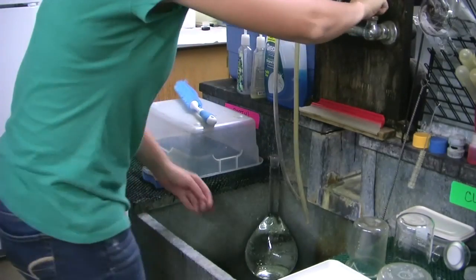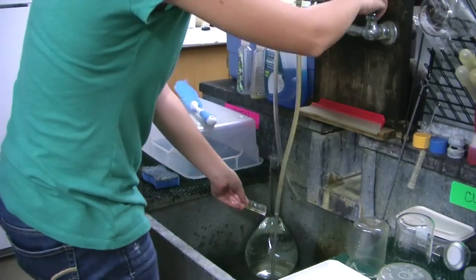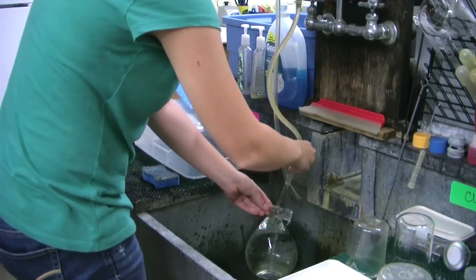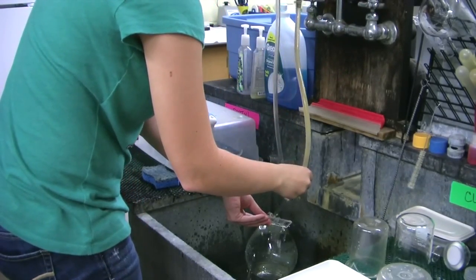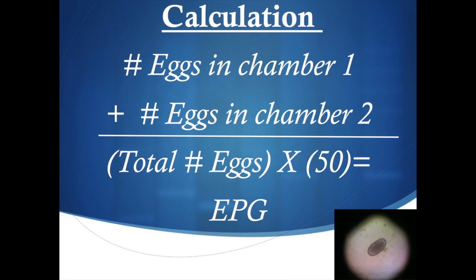Once you are finished with the McMaster slide, place it in water with soap to be cleaned. Let it soak or gently run water through the slide. Throw away feces and wash all other reusable equipment. Now, to determine the eggs per gram, or EPG, of the sample used in the demonstrated procedure, add the total number of eggs from both chambers and then multiply by 50. It is important to note that the factor of 50 is used when a 2-gram sample is analyzed. The factor is different when a different weight of feces is used.